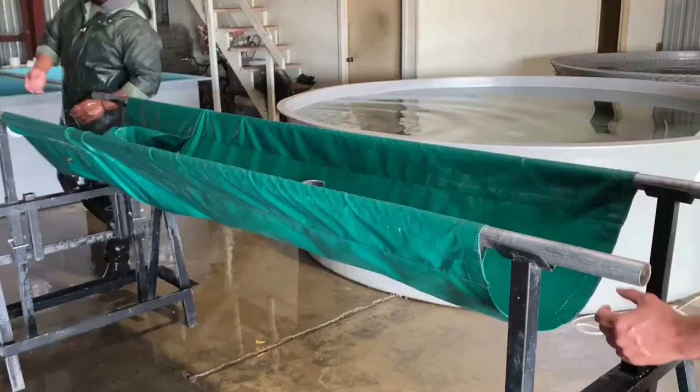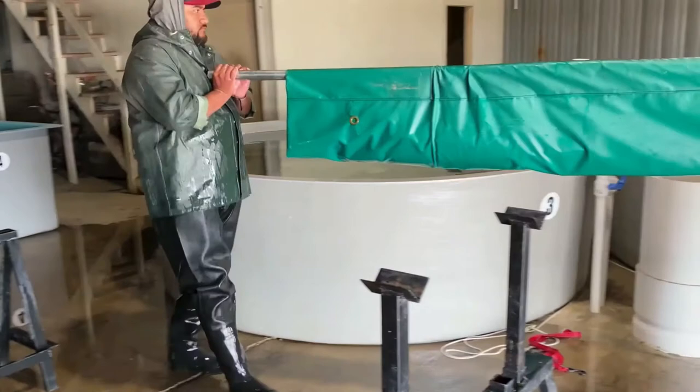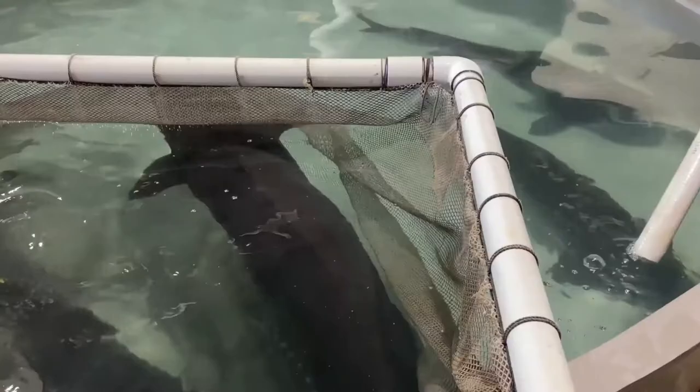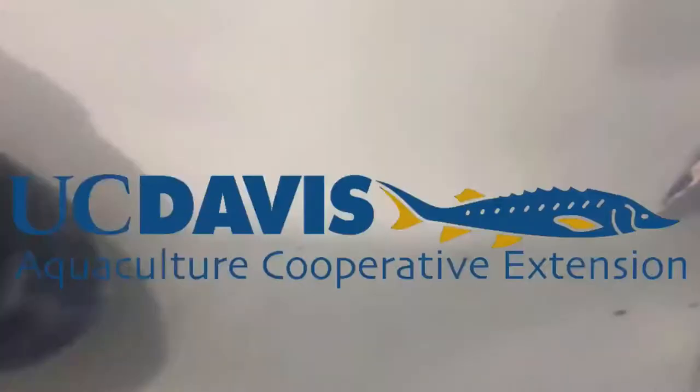Collecting a blood sample just behind the anal fin is one of the easiest locations to collect a blood sample from a fish. Finding the perfect location and depth for needle placement takes some practice, but with some experience a phlebotomist will develop a feel for the slight resistance of the cartilaginous sheath and find the vasculature within a couple of seconds. For UC Davis Aquaculture, this is Joel Van Inanum.